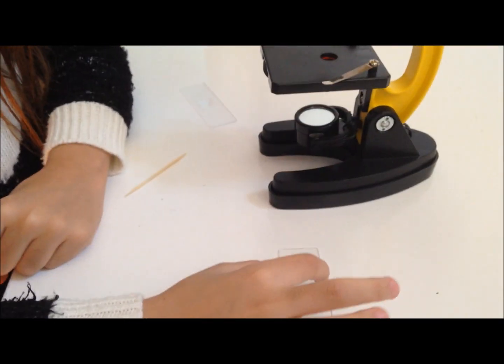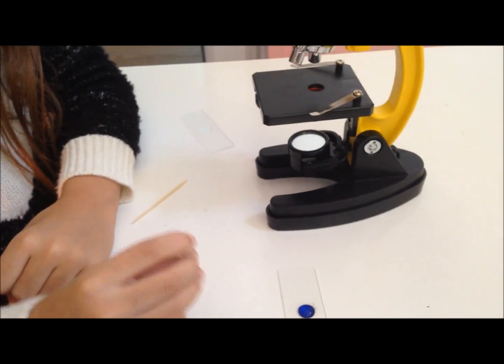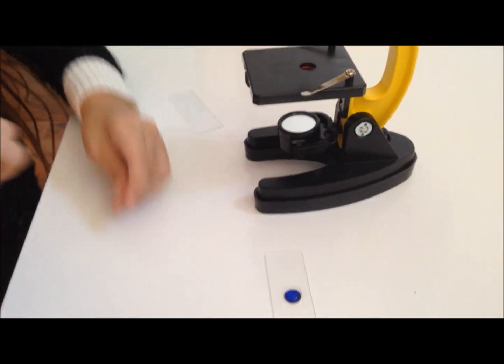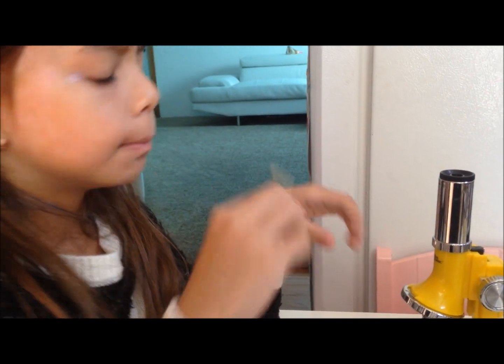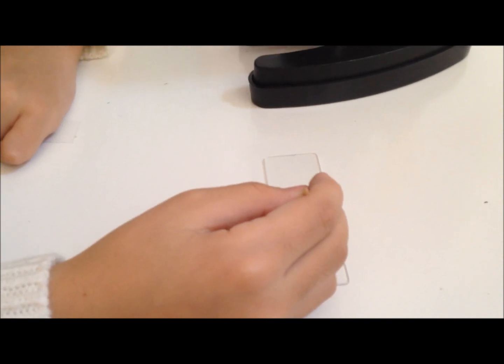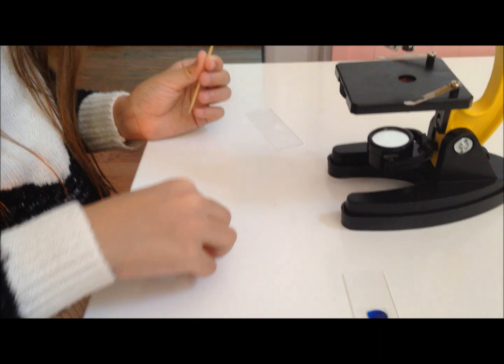We have to do a dime now. We have to cover it. We have to put that in my mouth. Mix it up in there. Mix it with a blue dye. That's about enough. And now what do you do? You cover it.